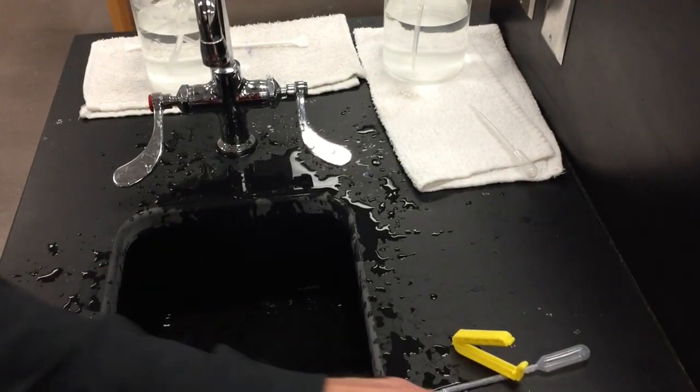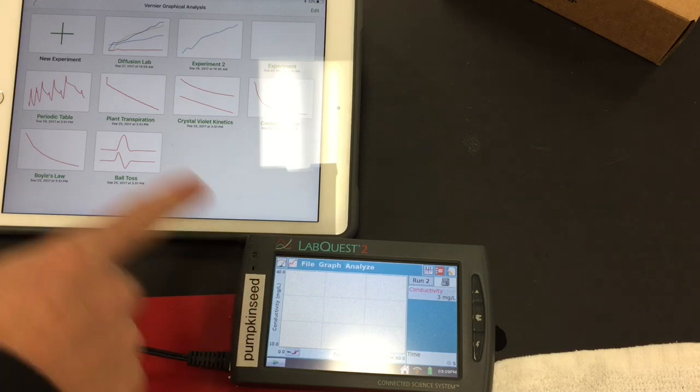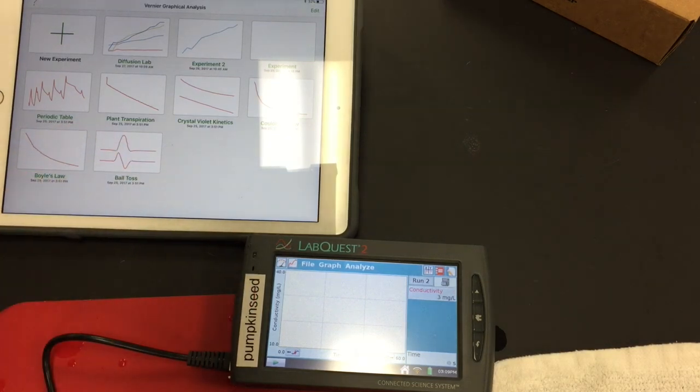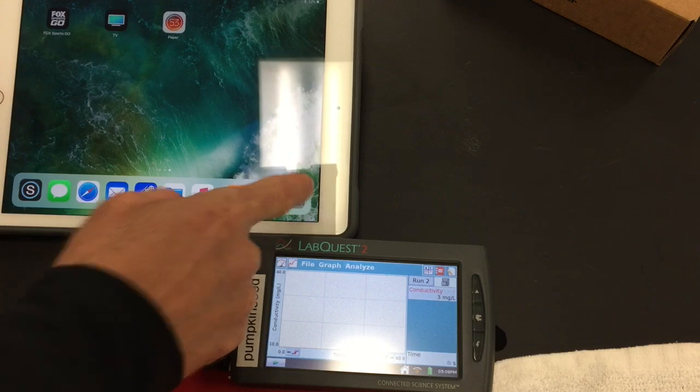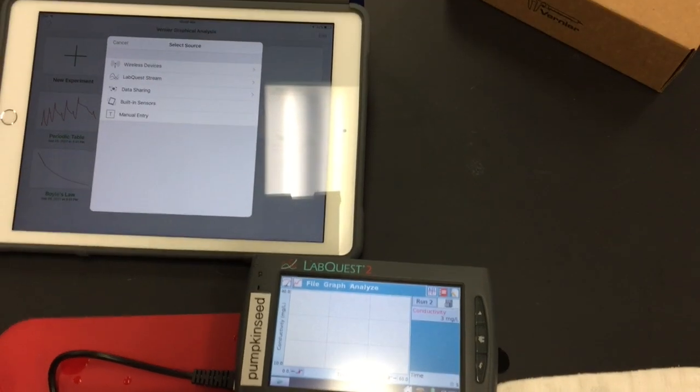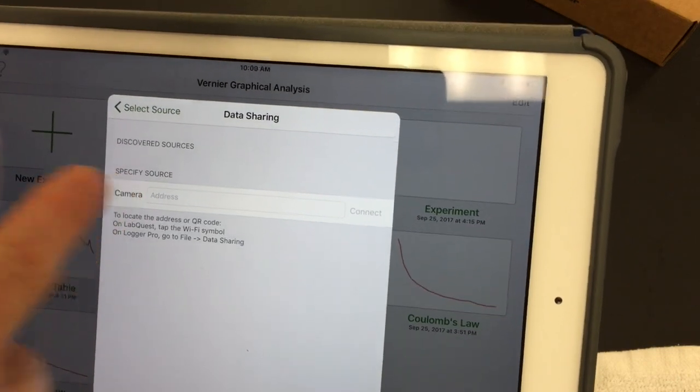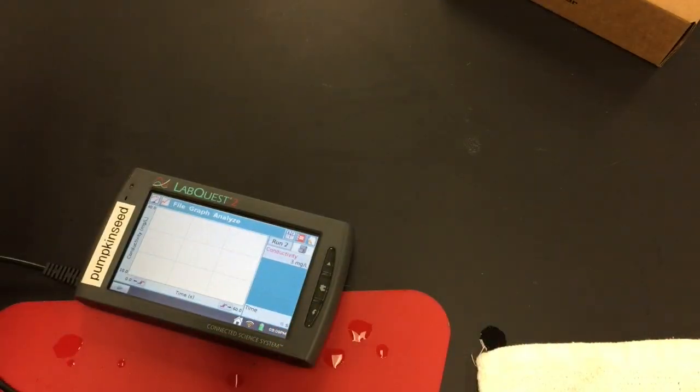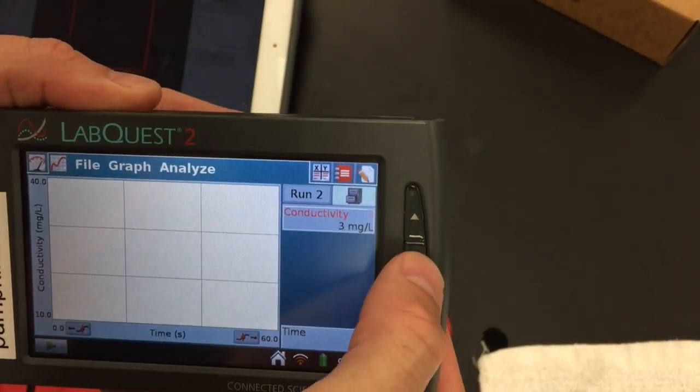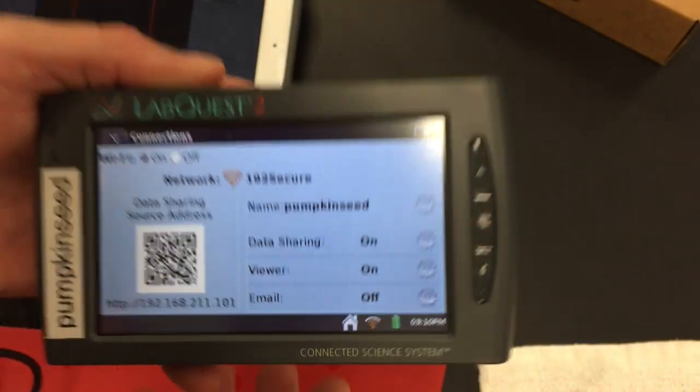The last thing I'm going to show is how to get the data from the Lab Quest device to your iPad. You'll need to have the Graphical Analysis app that we posted on Schoology. Open that up and click new experiment. From there you're going to click data sharing and select the camera. On your Lab Quest you'll need to bring up the code to scan, so hit the home button, go to connections, and scan that code. Then select connect.